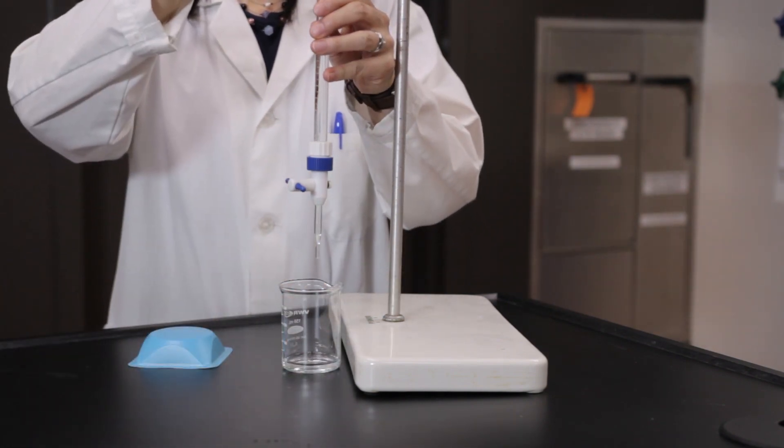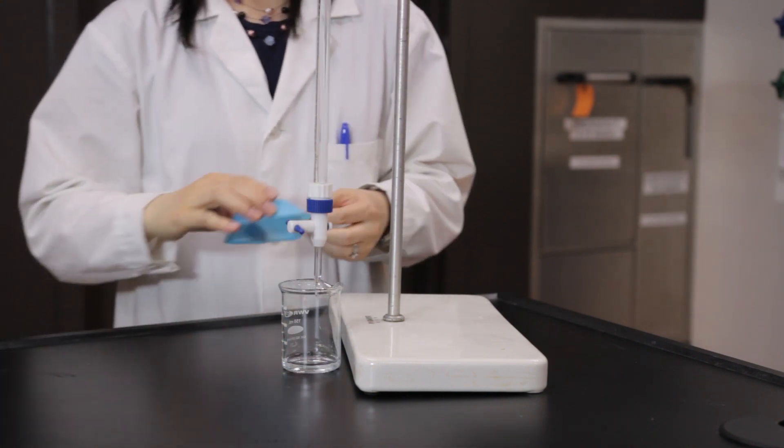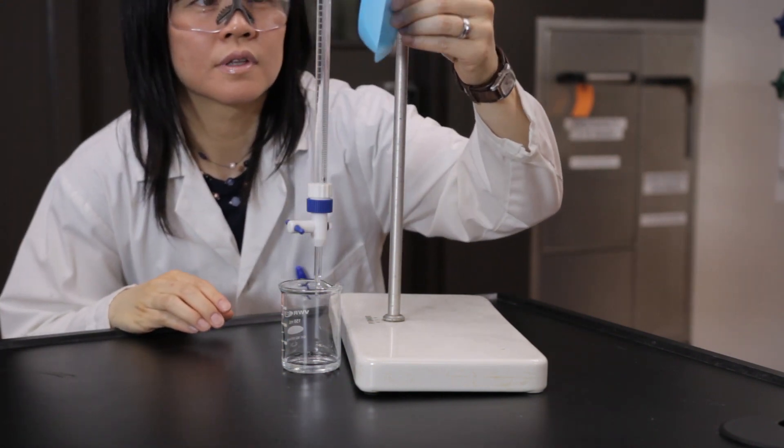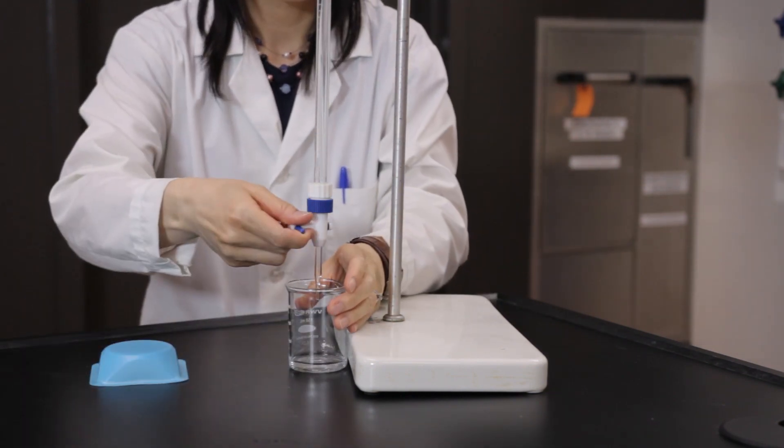Record the concentration of the sodium carbonate located in the burette. Into the same beaker, dispense 10 milliliters of the sodium carbonate solution. Be sure to read the bottom of the meniscus at eye level.